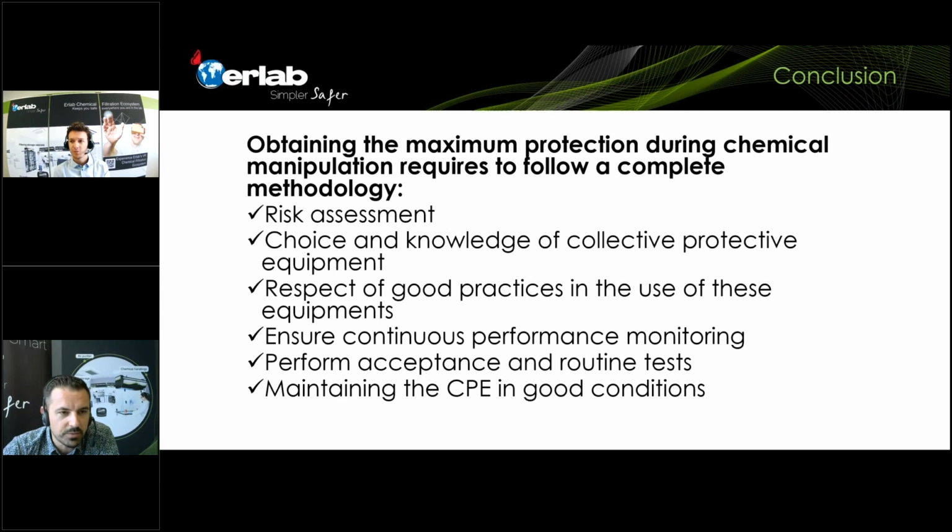So there is another question about when the filters of the ductless fume hoods have been spent, should they be considered as hazardous materials, and what is the best method for their disposal? And this question is from Giancarlo Reyes. Hi, John. Thank you for your question. A really good question as well. What do we do with filters that are saturated, that have to be replaced? So of course, this is considered to be chemical waste.